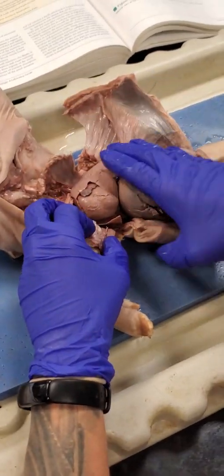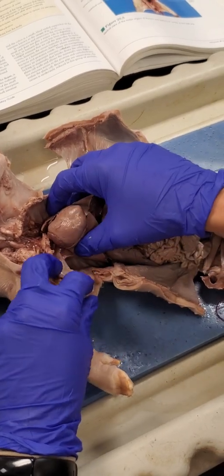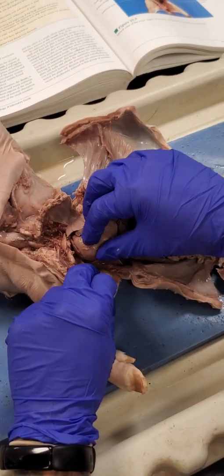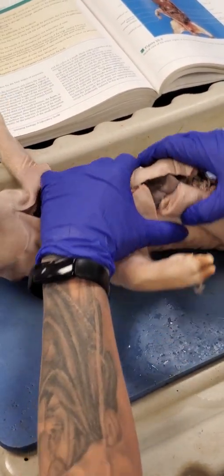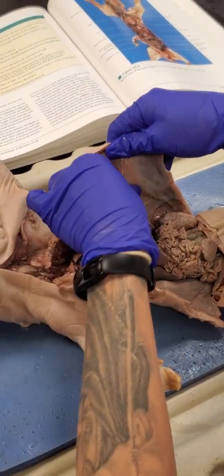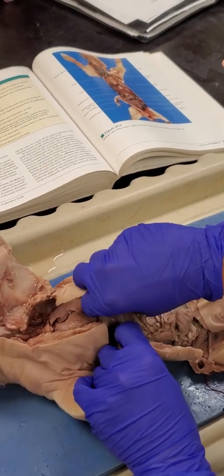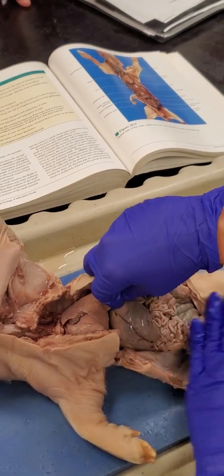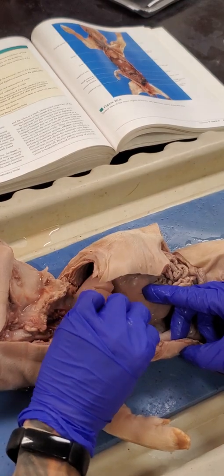Yep. And then, so our lungs, right? Our lungs are right here, and they kind of hug our heart. How big that heart is. Yeah, that's the heart. So I'll show you guys that in a second, but I also want to show you guys the diaphragm. So when we cut this open, see this part? This was a connective tissue that separated pretty much the heart and lungs from the liver and the intestinal tract. And so you can see it right here. It's still a little bit connected.